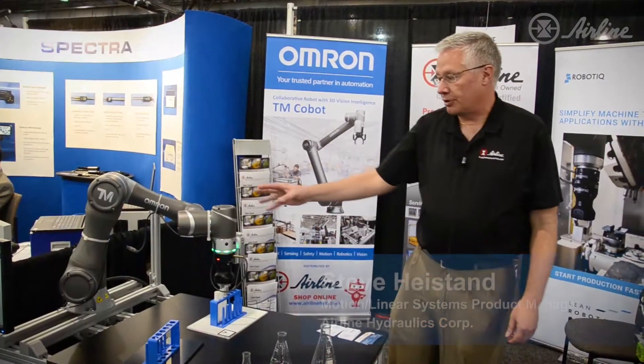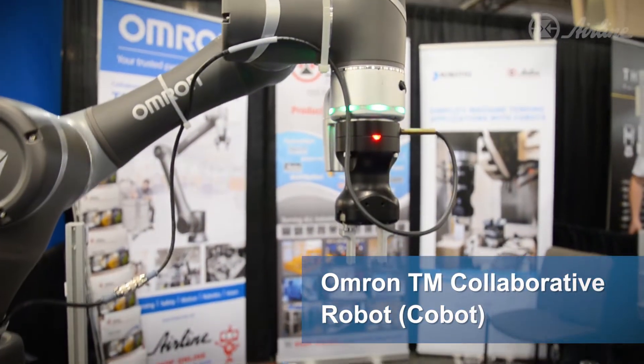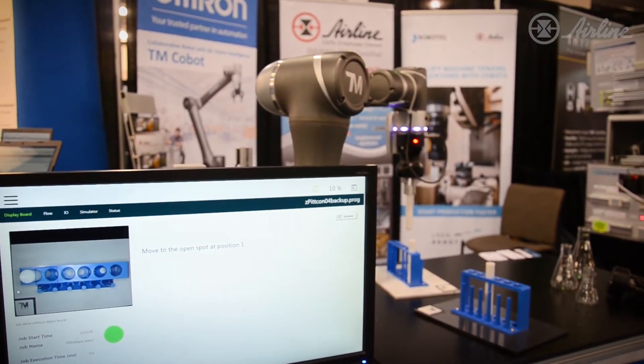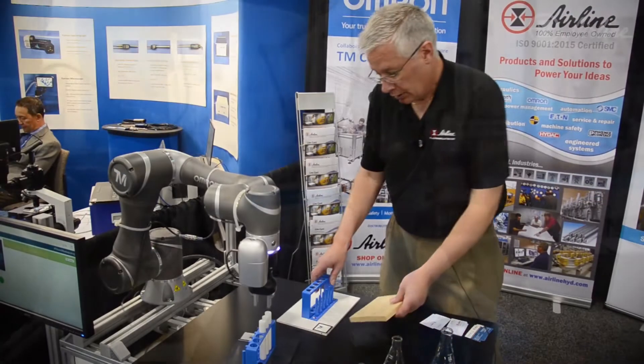Hello, I'm Steve Heistand. I'm the automation product manager responsible for robotics within Airline, and today we're featuring the Omron TM robot. This is a collaborative robot that can also operate in industrial mode. The collaborative robot will work beside a human and do some of the mundane tasks that a human's time could be better spent doing something else.